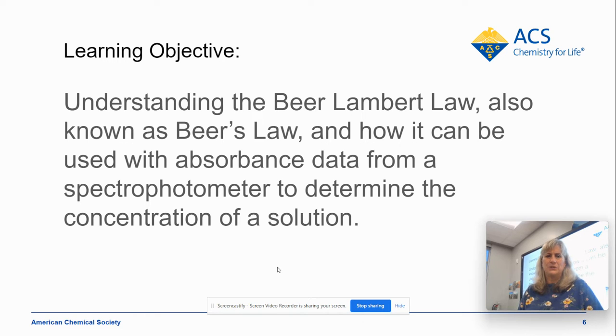Hello. Today I'm going to talk to you about Beer-Lambert's law, also known as Beer's law, and just a little bit about spectrophotometers and the absorbance data that we can get from them to determine concentration.